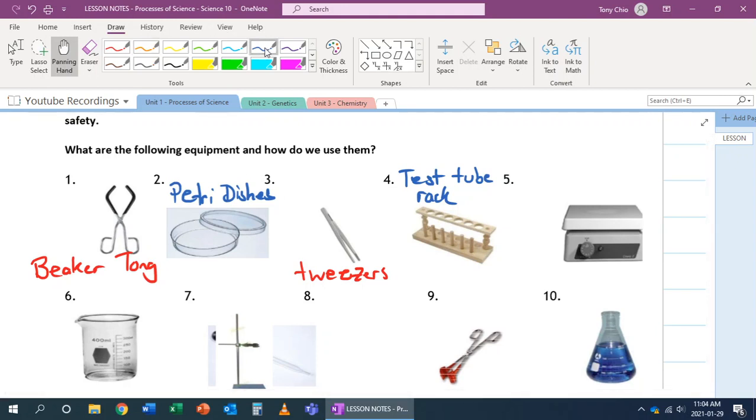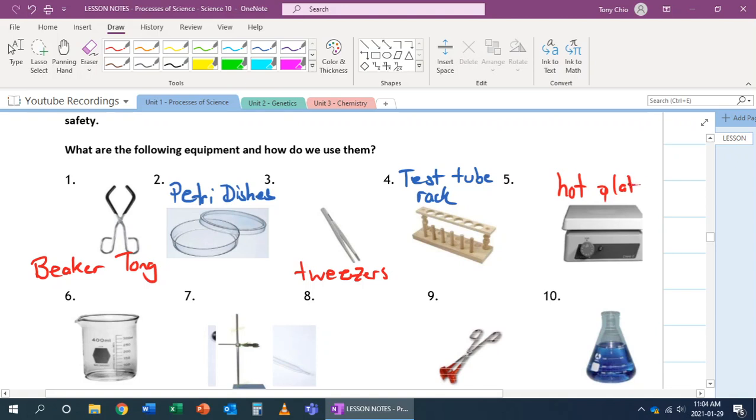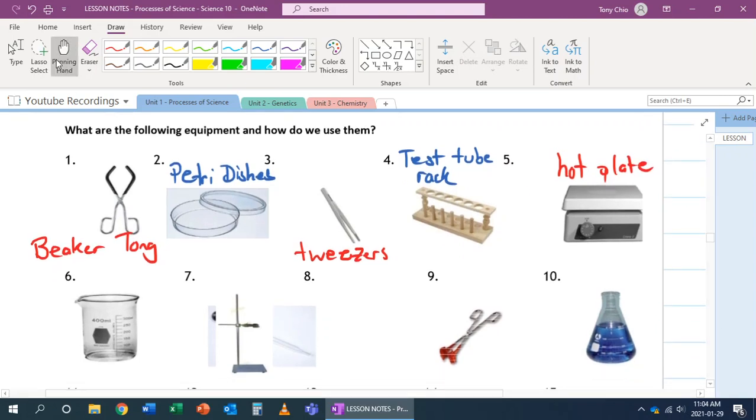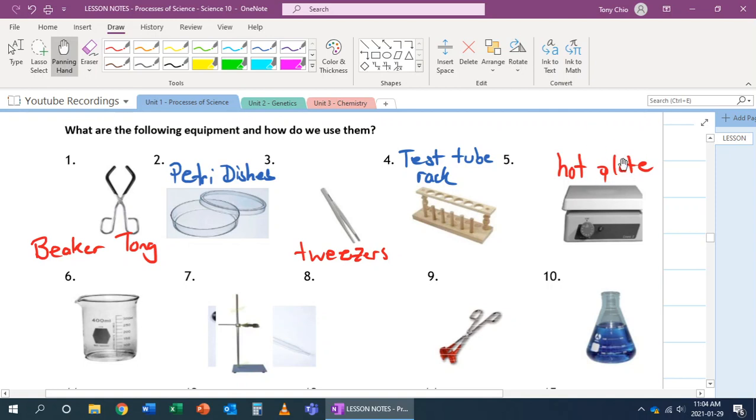Number five. Number five is called a hot plate. It's almost like a stove in which you can heat something up. Some hot plates are built with what we call a magnetic stirrer. And inside of it has something that is magnet in which it will start to spin. And if you have a beaker with a magnetic stir rod, it will stir that object for you.